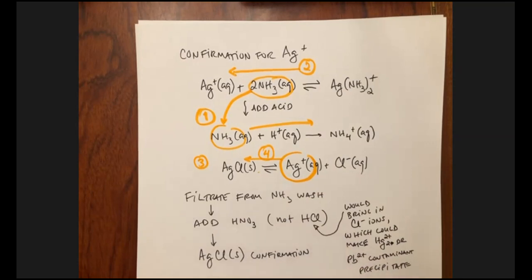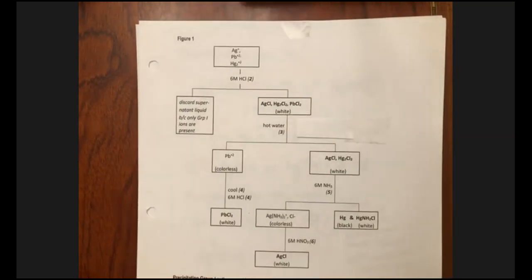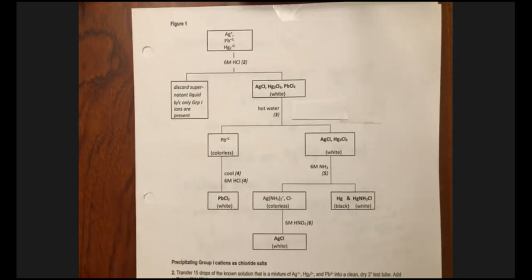So what I want to do now is I'm going to switch over here to show you the flow chart. So it's very important when you do these kinds of analysis that you have a flow chart. I know that some students don't like flow charts. Some people just don't like anything that has to look like a map. Like, for example, my wife doesn't like to read maps, and some people don't like flow charts. However, this is a very useful way of summarizing everything we're doing.